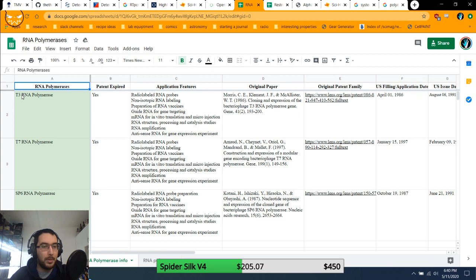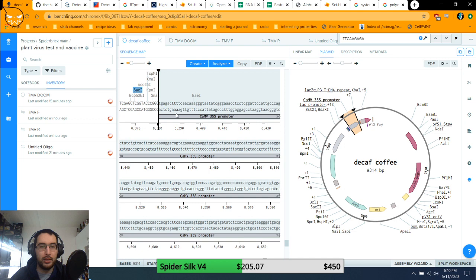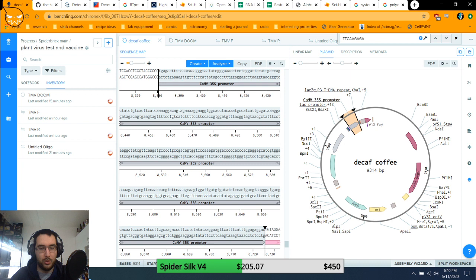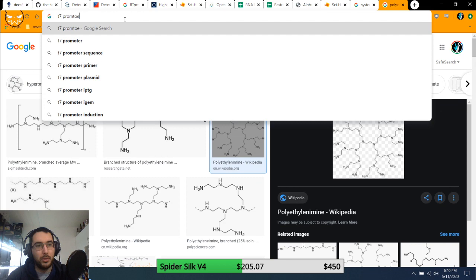What's really handy about these is the promoters. So the actual sequence of DNA that this enzyme will bind to is very tiny. So if we look at this, for example, this is the cauliflower mosaic virus promoter, and you can see it's not huge, but it's not tiny either. It's chunky. It is about 345 base pairs long, which is obviously way too long for what we're looking to do. Whereas the T3, T7, and SP6 promoters are like 10 letters long. They're absolutely tiny. In fact, let's look this up. T7 promoter sequence.